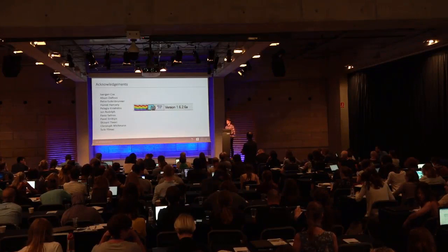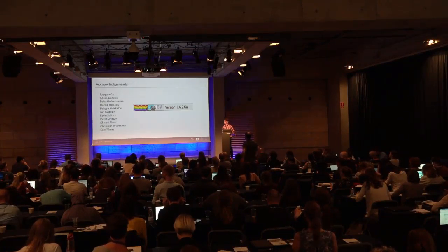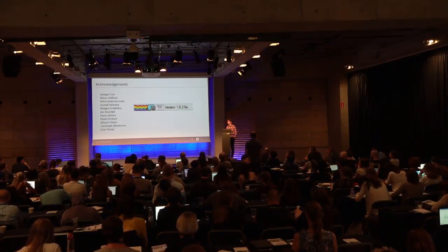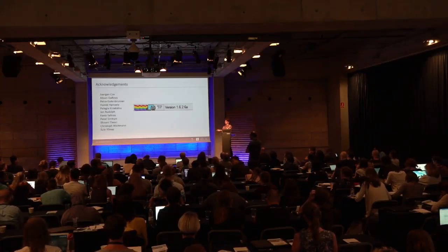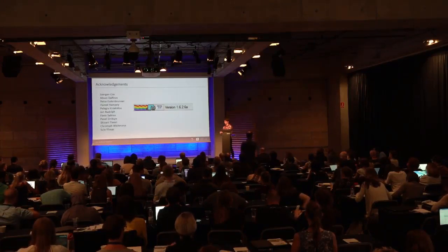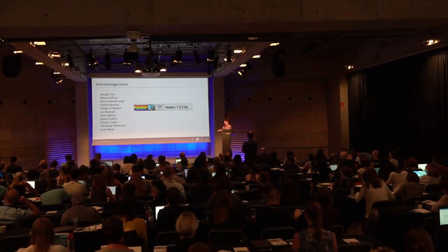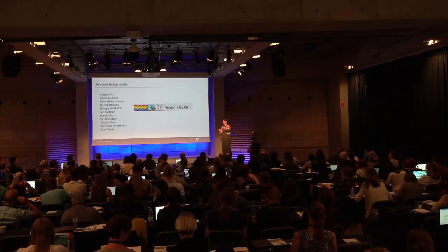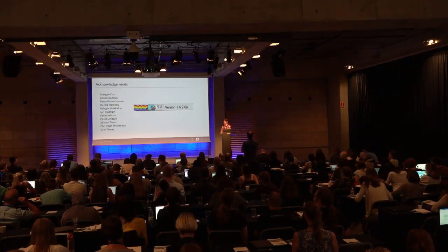Yeah, definitely. By having all 3 amino acids as potentially being modified, you have more search space, right? The reason it's set up as only serine threonine, or serine threonine tyrosine, is because in standard enrichments we don't actually get that many tyrosine phosphorylated peptides. So there you could just reduce the search space and use serine threonine alone. The reverse is not so true. When we look for just tyrosines, you see quite a lot of the peptides also contain a phosphoserine and a phosphothreonine. So if you use just tyrosine, you would probably lose a lot of the tyrosine phosphorylated peptides.